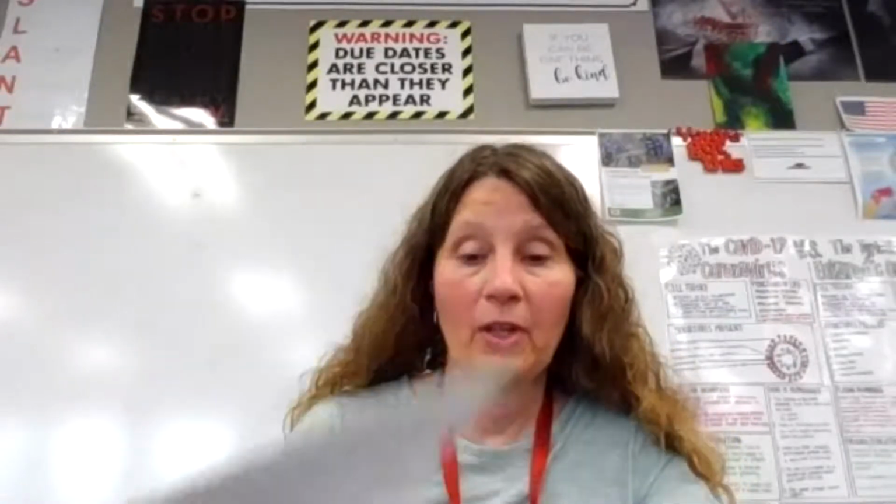So make sure that you have your directions in front of you and make sure you follow these instructions really, really carefully. One of the important things is that you only need a really small portion of a leaf. So all you need is a really small piece. This is a couple of centimeters by a couple centimeters. The other thing is that we know there are many more stomata on the underside. So make sure you know which side is the bottom, and it's generally the side that is a little bit less colorful, a little bit paler in color.